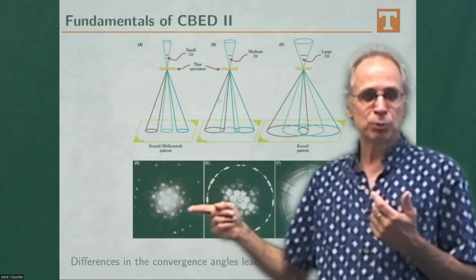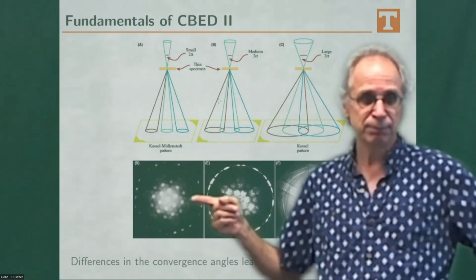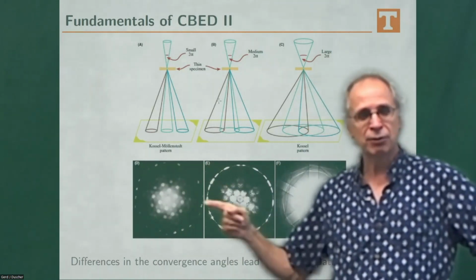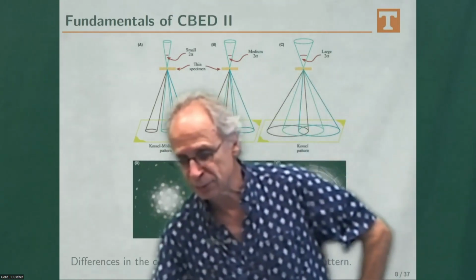This is basically a spot pattern. So that's not relevant for STEM. So you're not getting there. So you don't want to do that. We wouldn't consider that STEM anymore if you have very, very small angles. We can do it, but we usually don't.